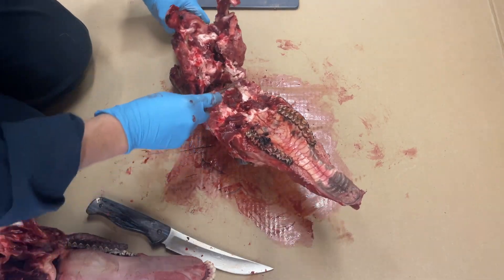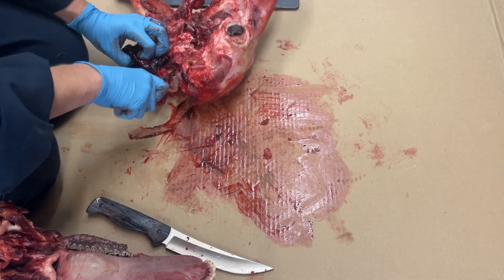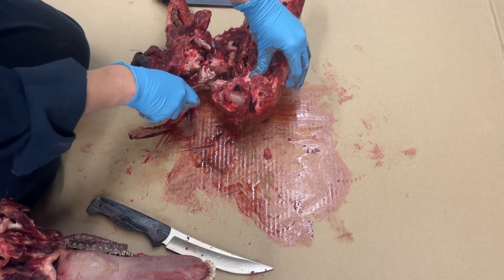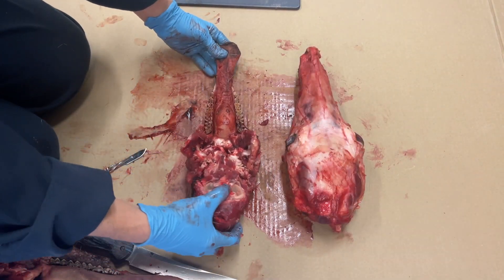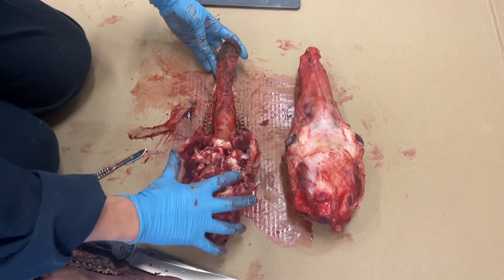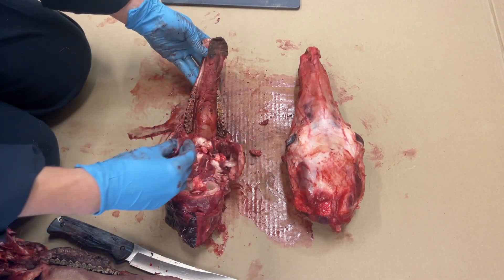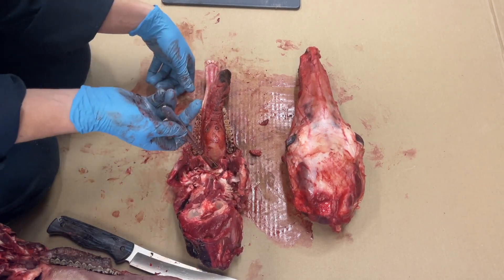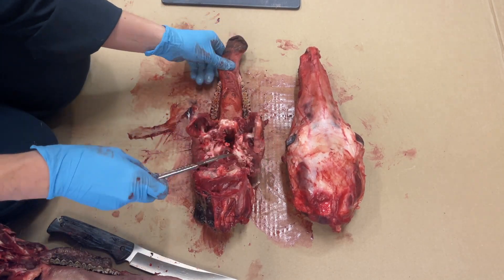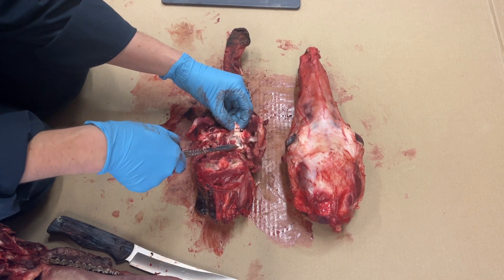You can then remove the first vertebrae with the lower jaw. You are left with the top of the head and the lower jaw bone with the vertebrae attached and the arches of the lower jaw bone intact. The tonsils are intact and protected by tissue located here, and the retropharyngeal lymph nodes are located here, ready for removal and testing.